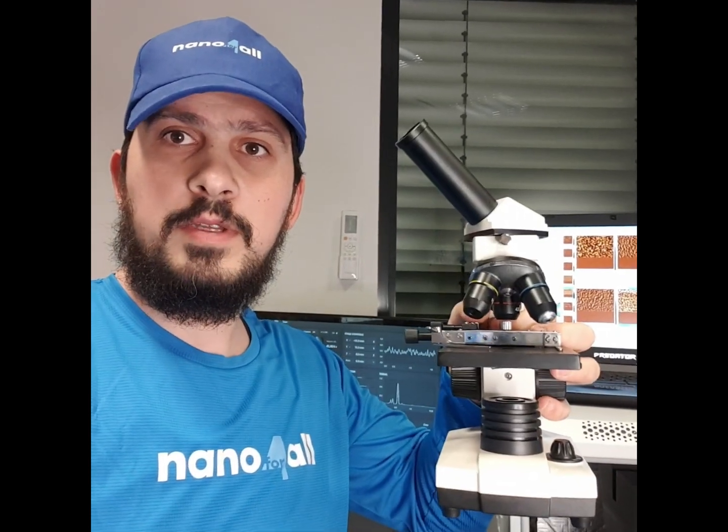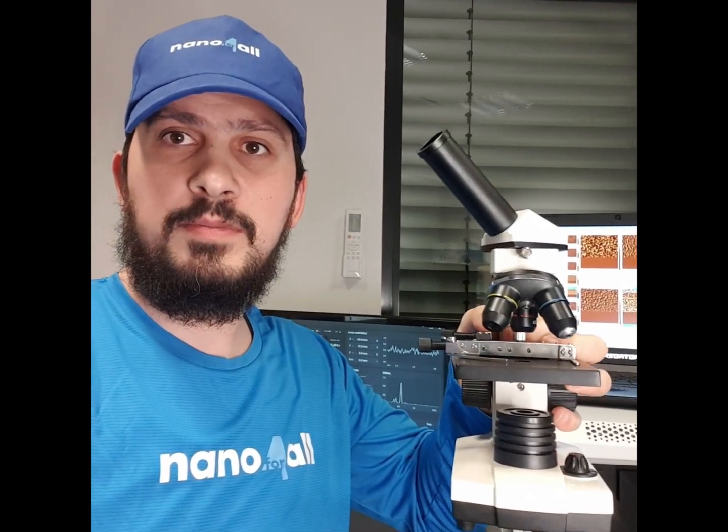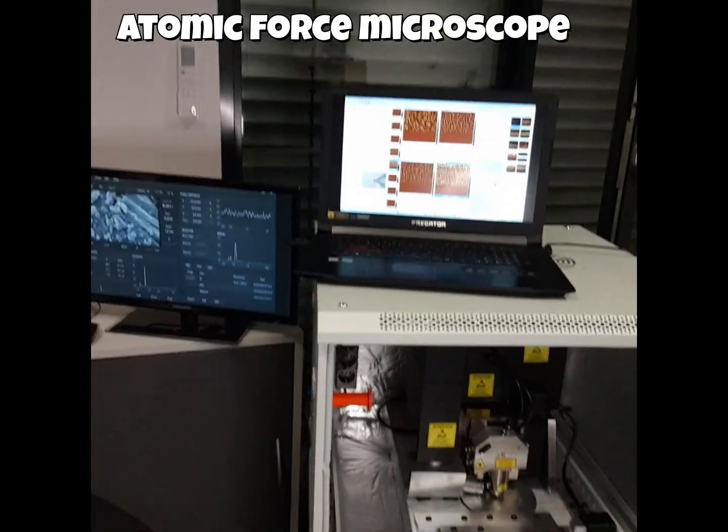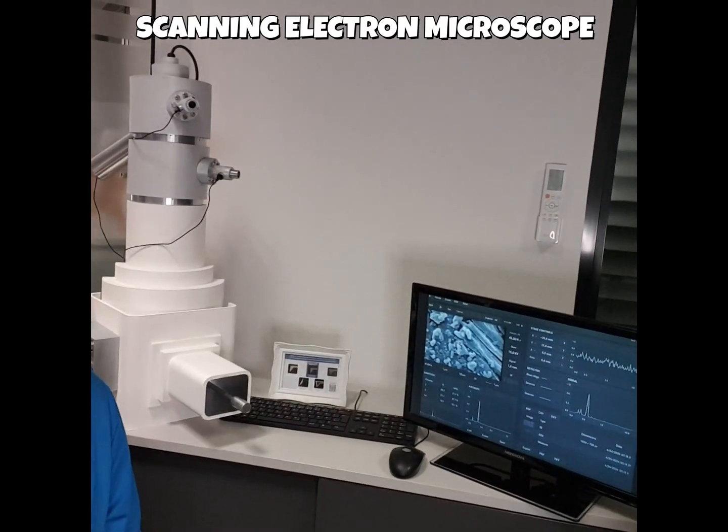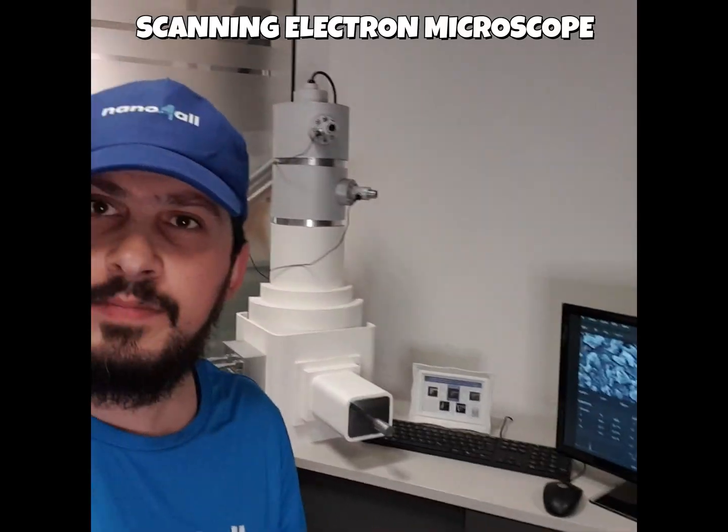You definitely know what a microscope is — it allows you to magnify and see things down to the micro scale. But when it comes to the nano scale, you need something more powerful: that's the nanoscope. This is an atomic force microscope, and this is a scanning electron microscope.